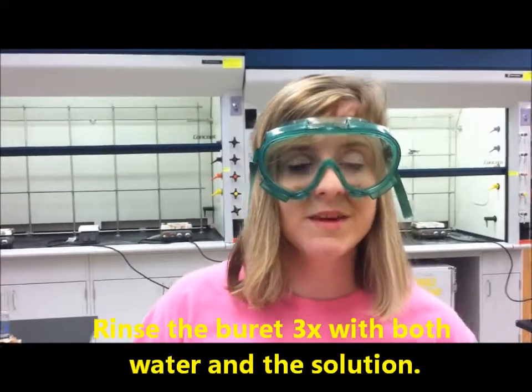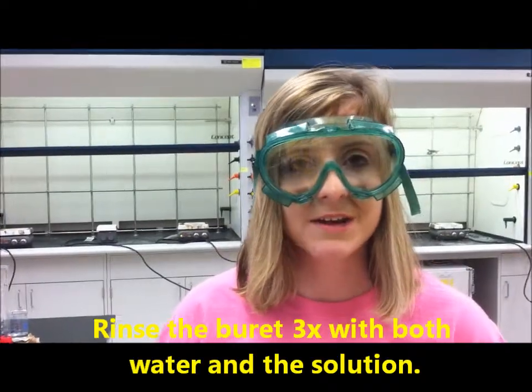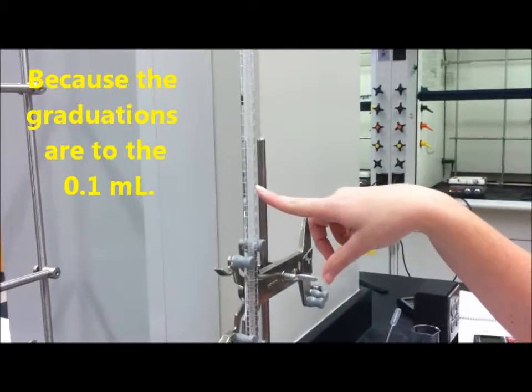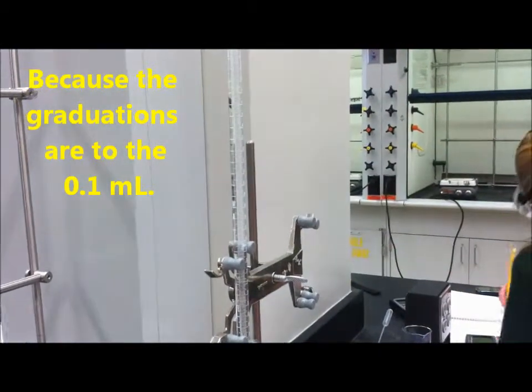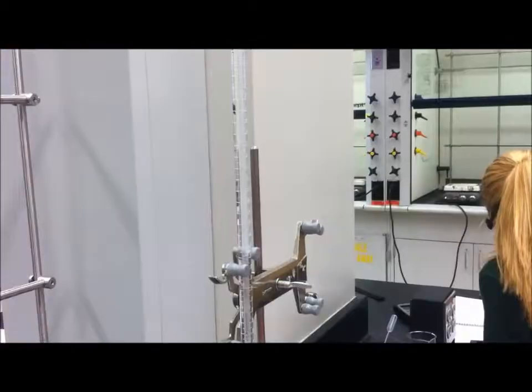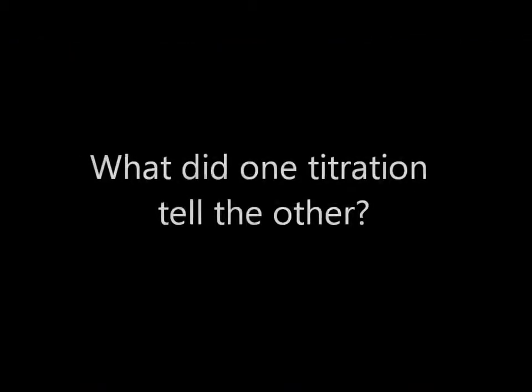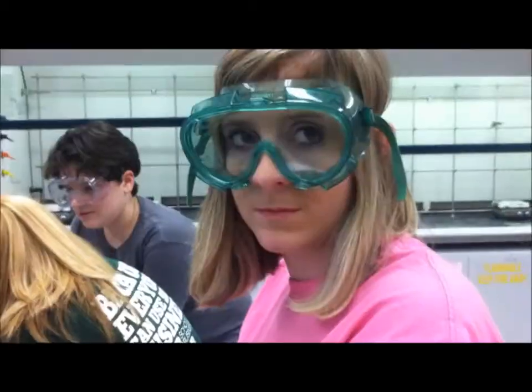For the experiment, the burette must be rinsed 3 times each with water and solution. Because the graduations are to the 0.1 milliliter, you need to report the volume to the 0.01 milliliter. So, okay, the initial volume is 0.2 milliliters.